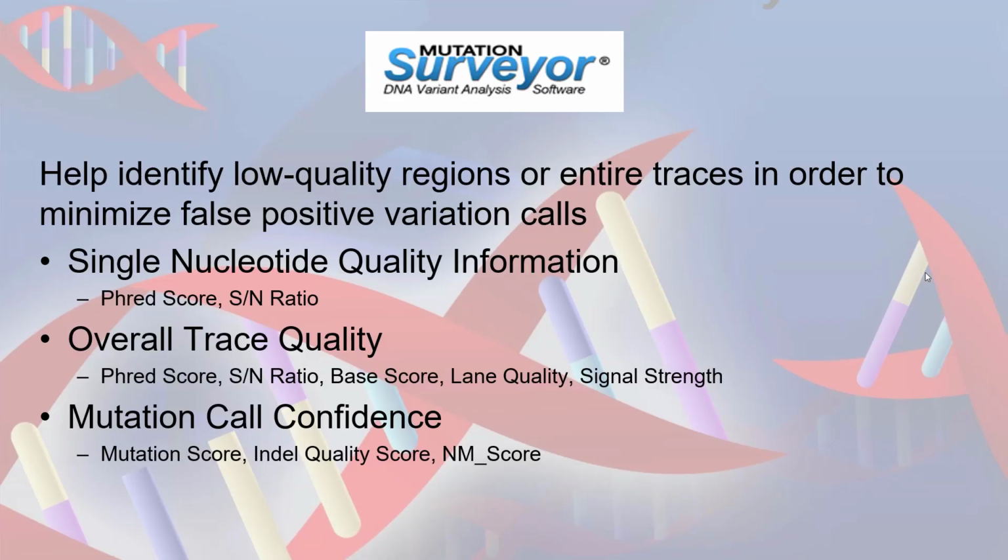Quality values are used to assess confidence and accuracy of sequencing as well as mutation calling. These scores can be used to help minimize false positive calls by identifying regions of low quality in the trace files. Quality values can be assigned to measure nucleotide quality, such as Phred Score and signal-to-noise ratio values. These scores can then be collectively used to measure the quality of an entire trace.